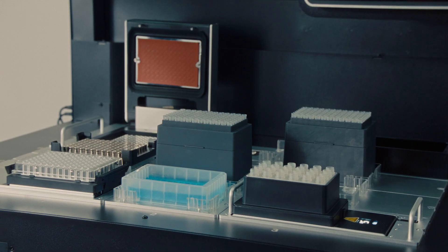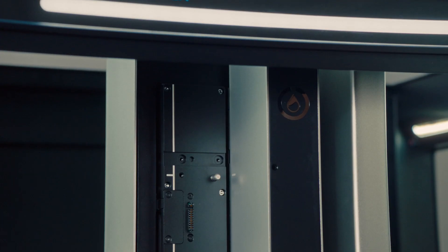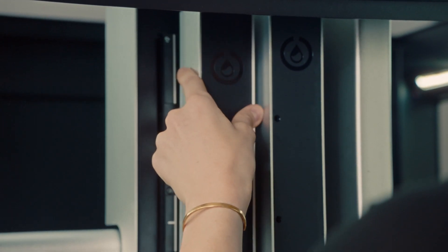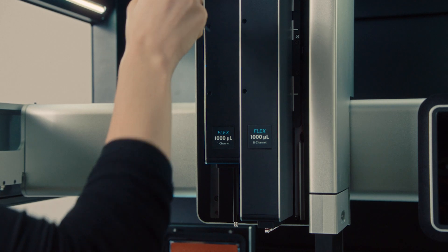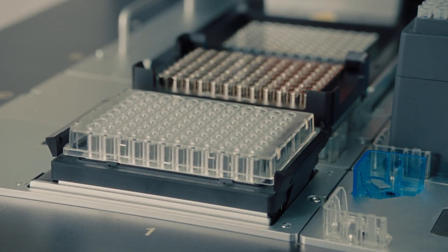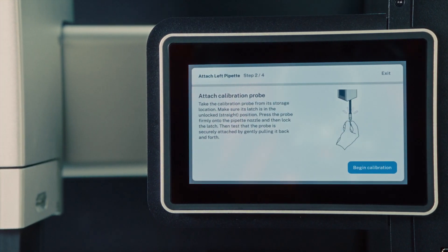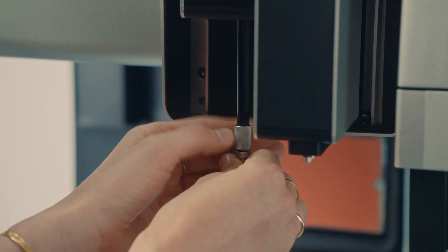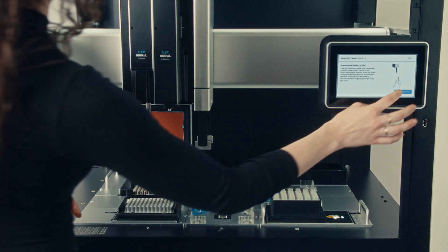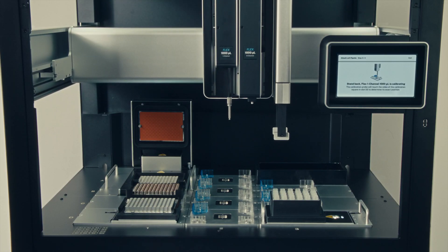The Opentrons Flex can be set up in days rather than weeks, so as a result you can get going with your science that much faster. Similarly if you need to change a pipette, add or swap a hardware module, those types of changes can be done in literally minutes. After installing a pipette, it's extremely straightforward to calibrate. We've automated this entire process with a few prompts from the Opentrons app — it really just takes a matter of clearing the deck and getting the robot ready to go.